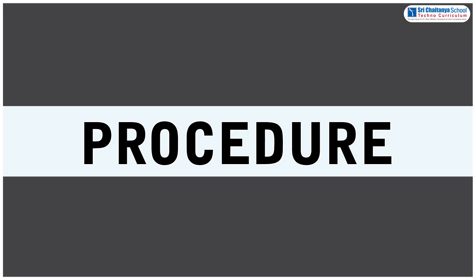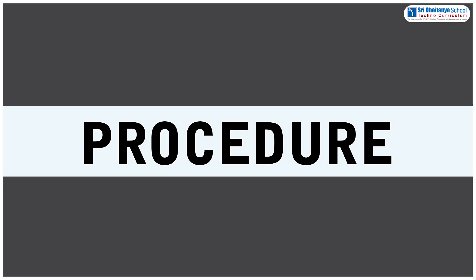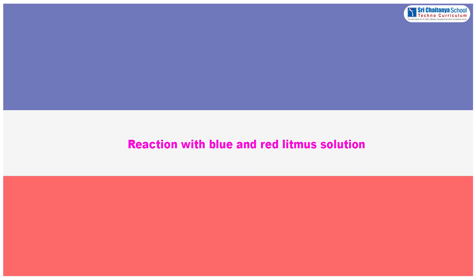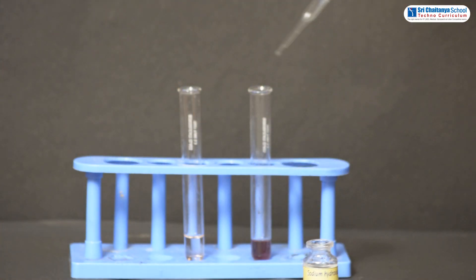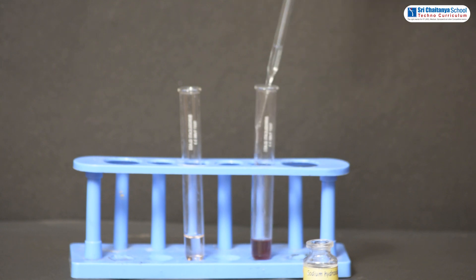Now it is time to see the procedure. Reaction with blue and red litmus solution: Take small amount of red and blue litmus separately. Now add NaOH solution to each with the help of droppers.